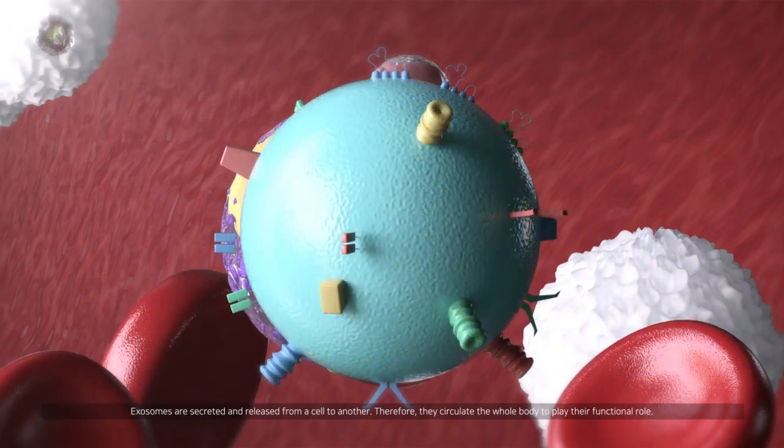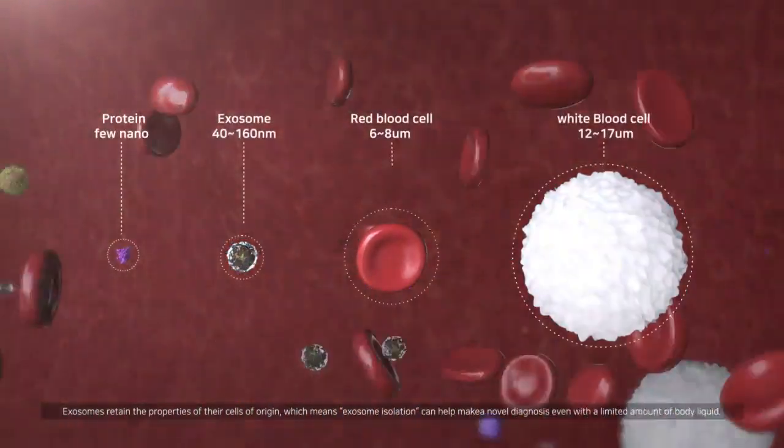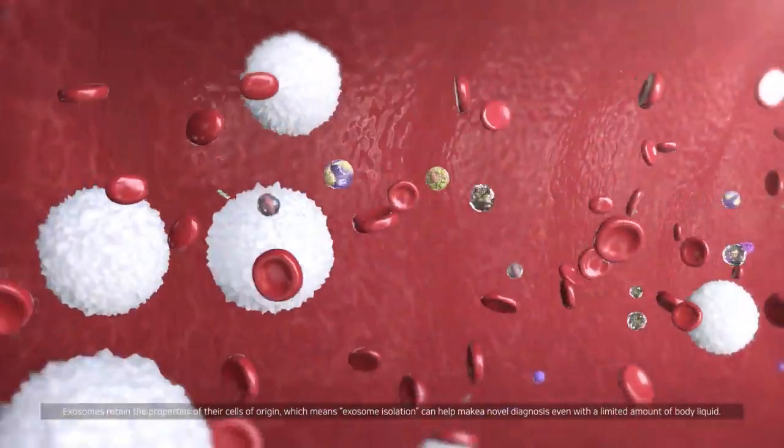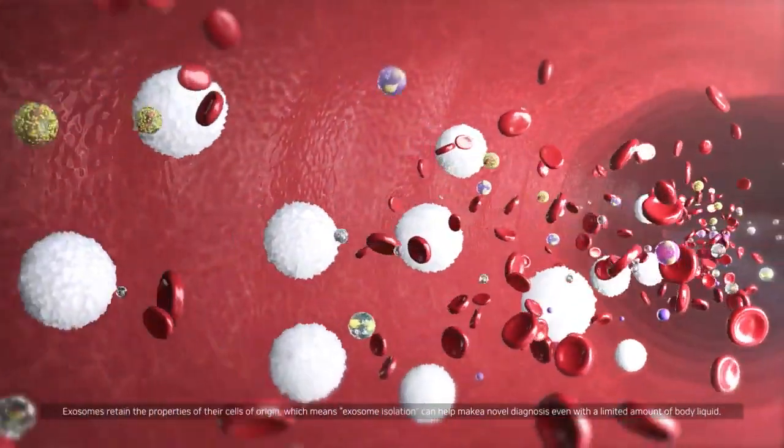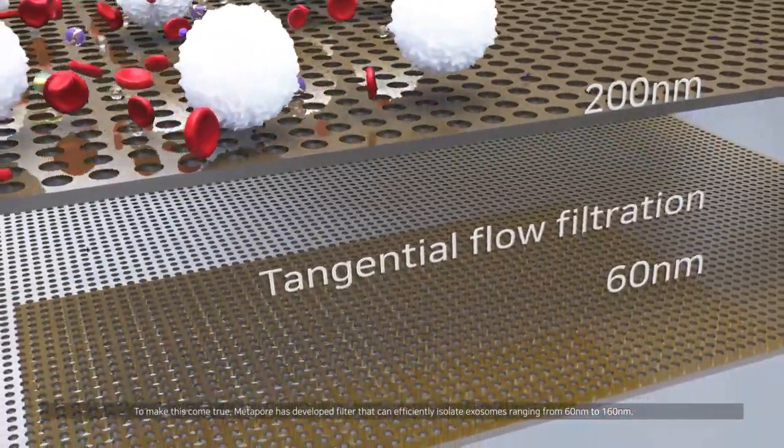Exosomes are secreted and released from a cell to another, therefore they circulate the whole body to play their functional role. Exosomes retain the properties of their cells of origin, which means exosome isolation can help make a novel diagnosis even with a limited amount of body liquid.